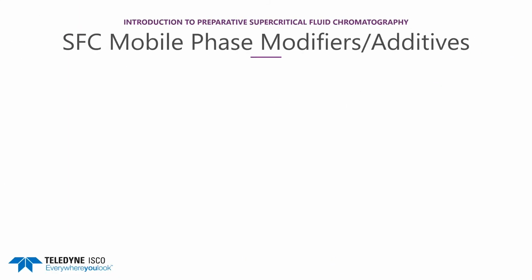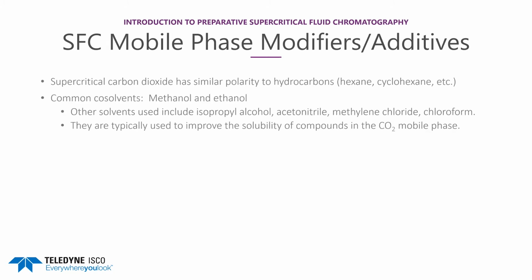In general, use an acidic modifier for acidic compounds and a basic modifier for basic compounds. The general idea is to make the compound being purified less polar so it elutes easier. The modifier may improve the peak shape and may allow improved or faster elution.